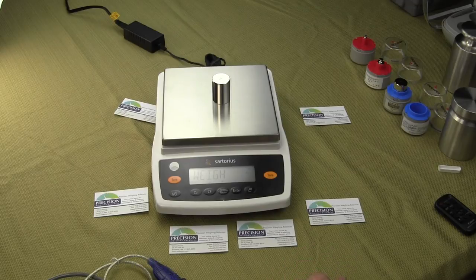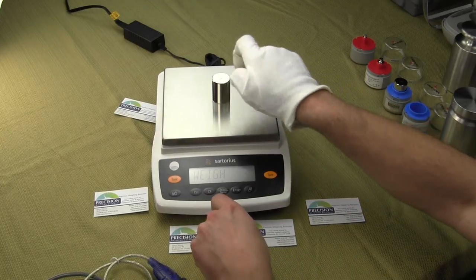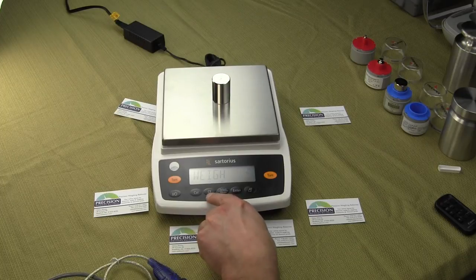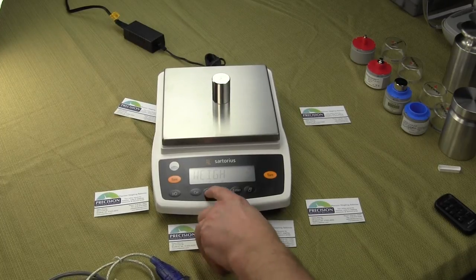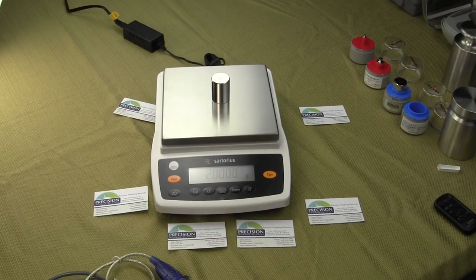Those are the functions or applications that the balance offers. To get out of the application mode, you just simply press the CF button, which is the clear function. Hit clear function a second time and we're back to weigh units.